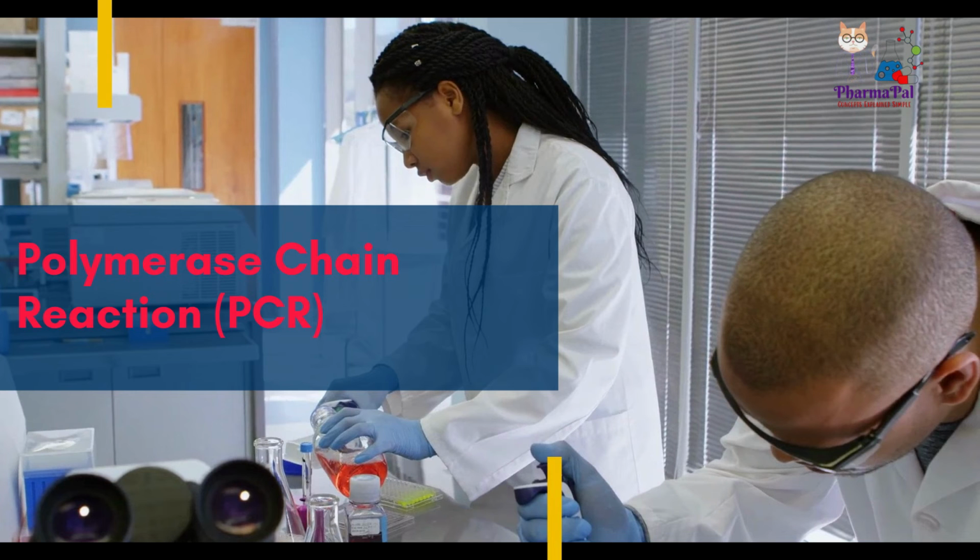Primers can be obtained from commercial sources or synthesized to order. Factors to consider include primer length, which should be long enough for stable hybridization and uniqueness in the genome. The base composition should avoid repetitive and single-base sequences, as well as internal complementary sequences or overlaps with other primers.